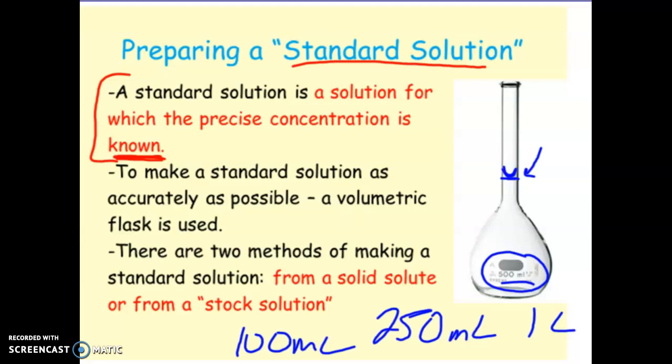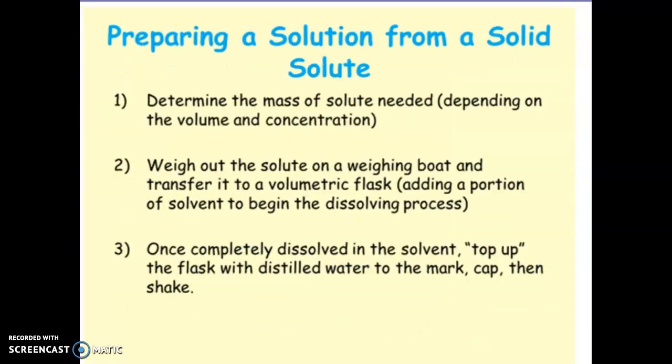How can we make a standard solution? There are two ways, as I mentioned. We can make one from a solid solute and dissolve it in water, or we can use a stock solution, which we're going to talk about later on. For now, we're going to look at how to do it from a solid solute.